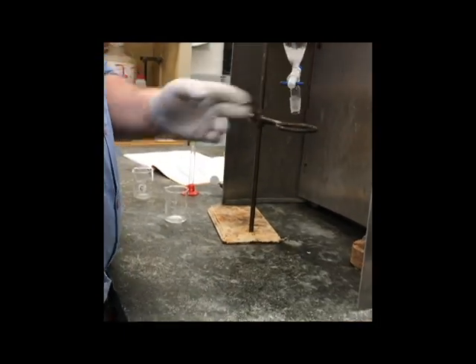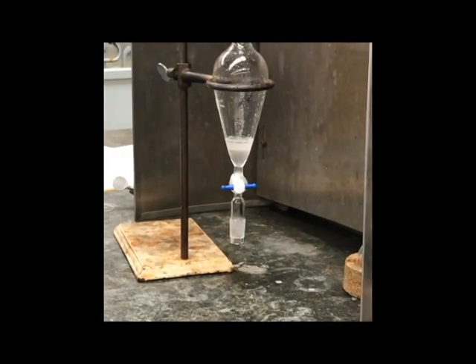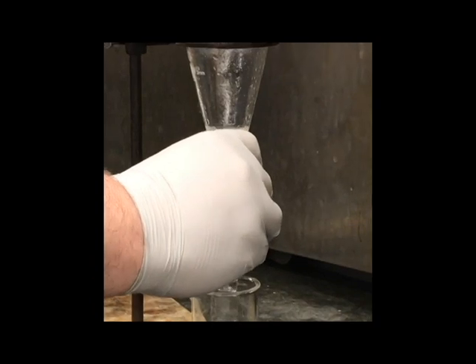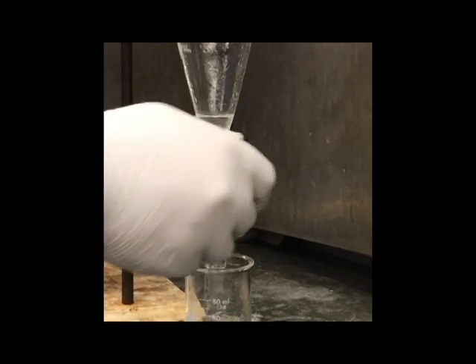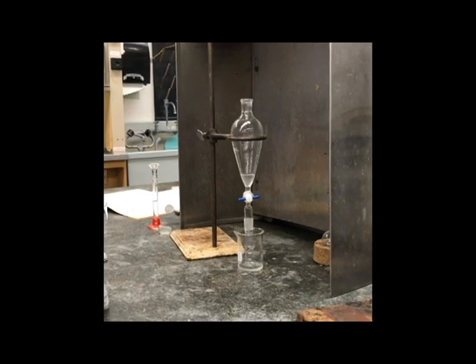So once we feel like we've done a good enough job, we're going to put it back in here, take off our cap, and we're going to wait for the layers to separate. So now the layers have been separated, we're now going to separate out the bottom layer. So by opening this up, just like so. And now we're going to repeat this process for 5 milliliters of water and another 5 milliliters of a saturated brine solution.